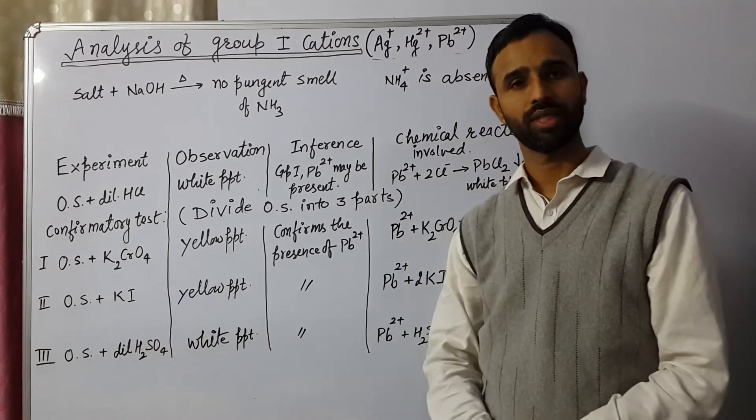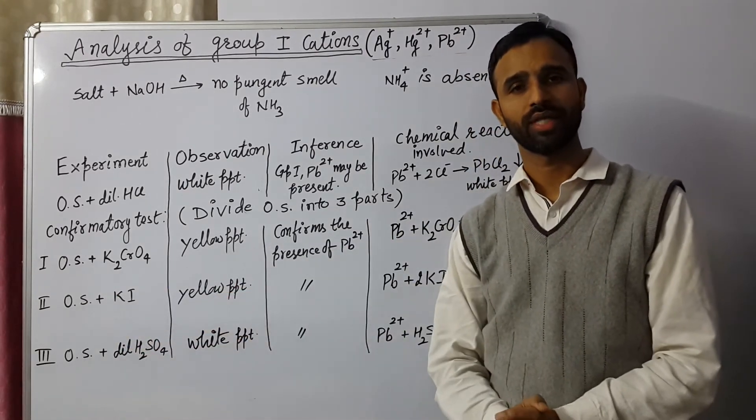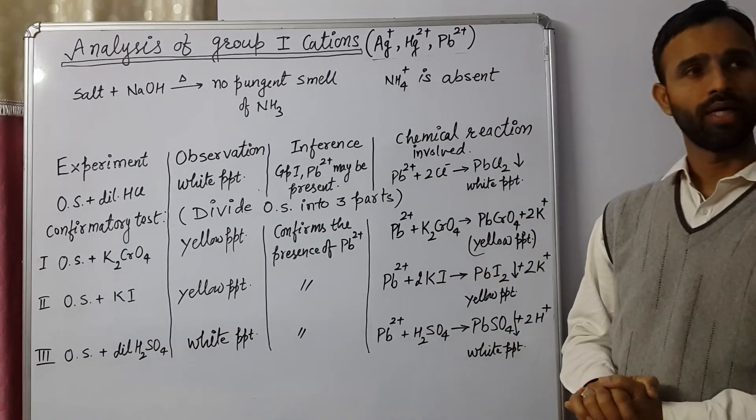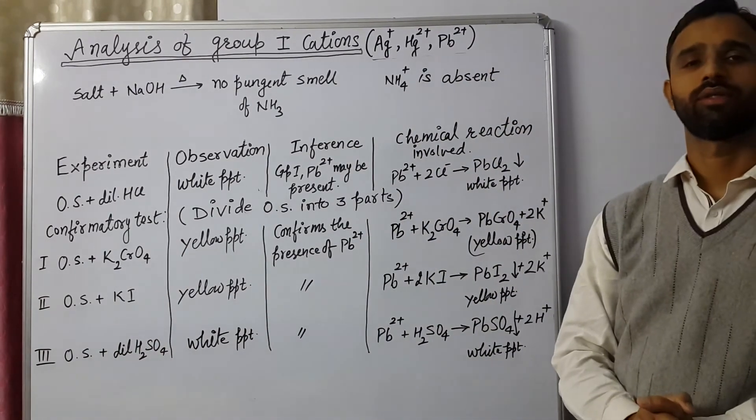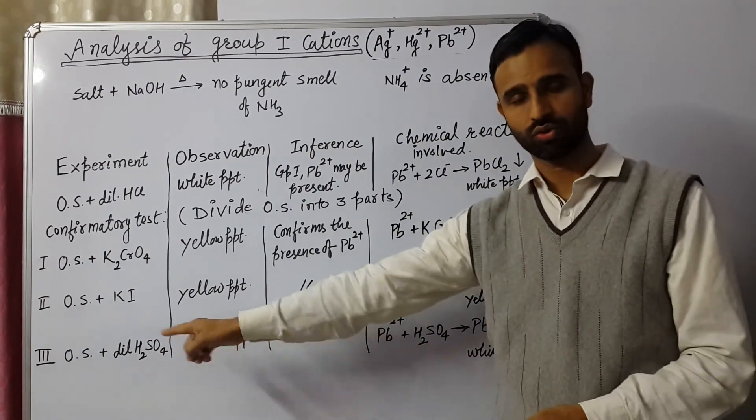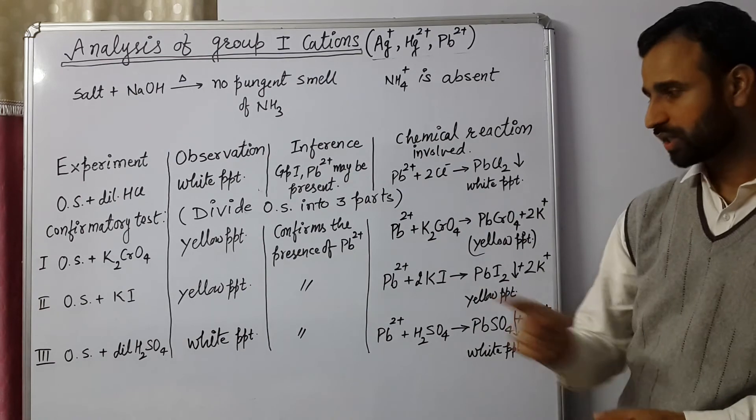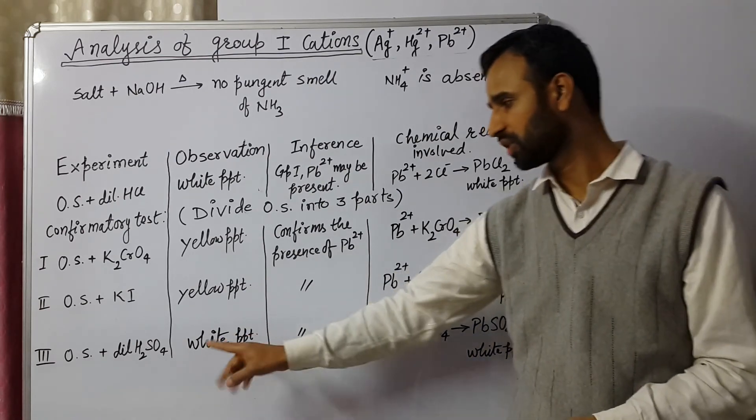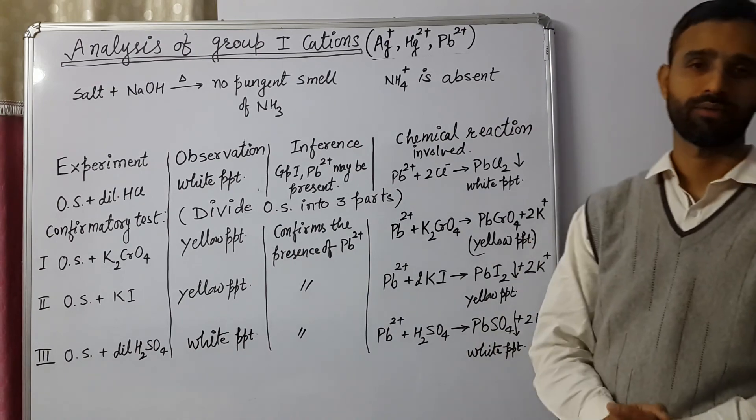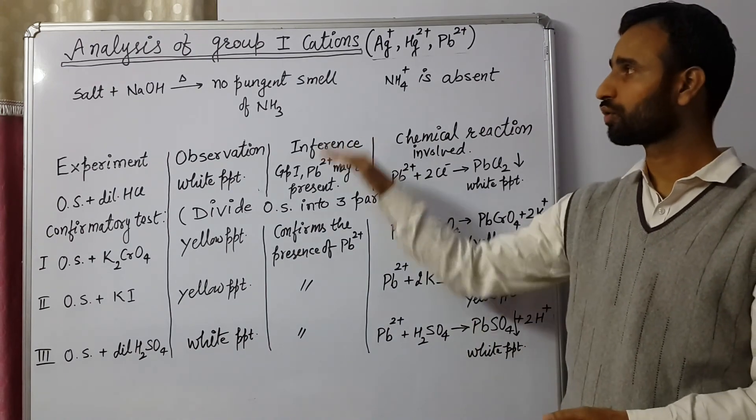In second test tube, we add KI, yellow precipitate appears. That is of PbI2. And in third test tube, we add dilute H2SO4. When we add dilute H2SO4, again white PPT appears. And that white PPT is of lead sulfate. So that's all for group 1.